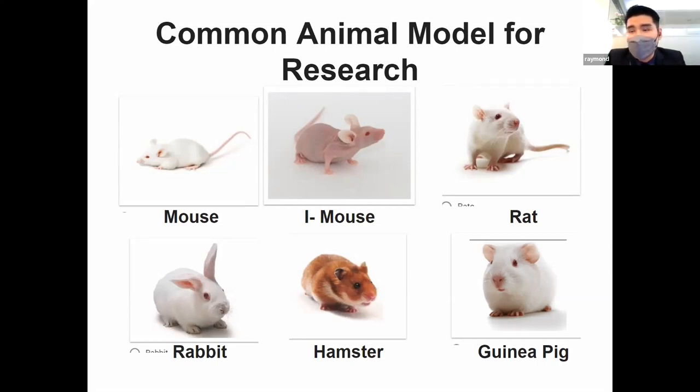Notice all of their sizes are pretty small. The biggest perhaps is the rabbit. This is of course to aid us in handling them. We don't want an animal model that is big. First, it's because of the storage. Second, the handling can be deemed difficult.